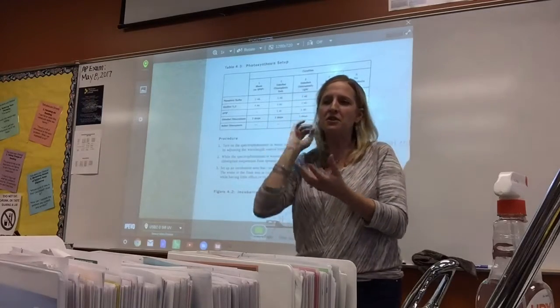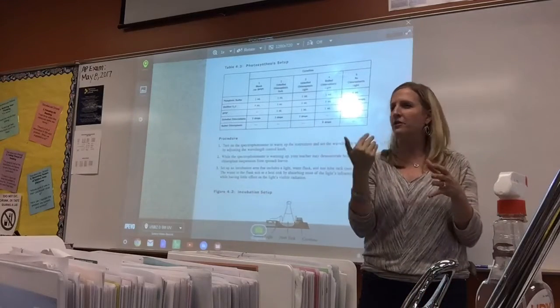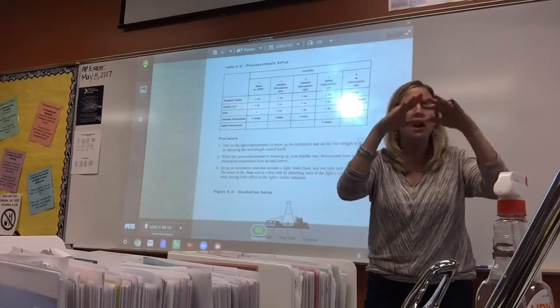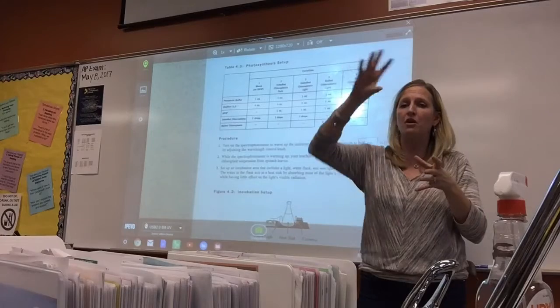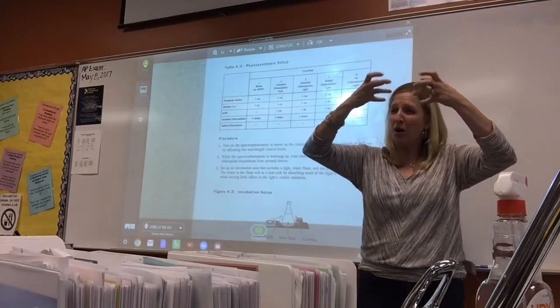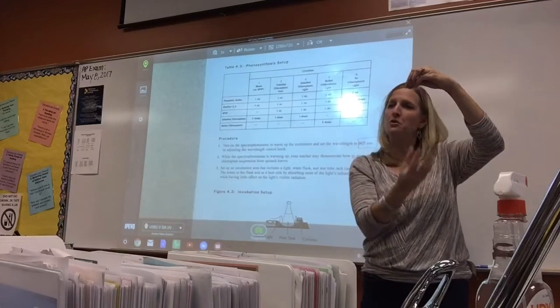And so then what you would do is, I would take a beaker and, I don't know if any of you are familiar with cheesecloth. It's a cloth, you can buy it in the store. It's a cloth and it acts as a filter, so you can pour the spinach solution on it, and all the big parts of the spinach get stuck in the cloth, and what drips through is the smaller part.